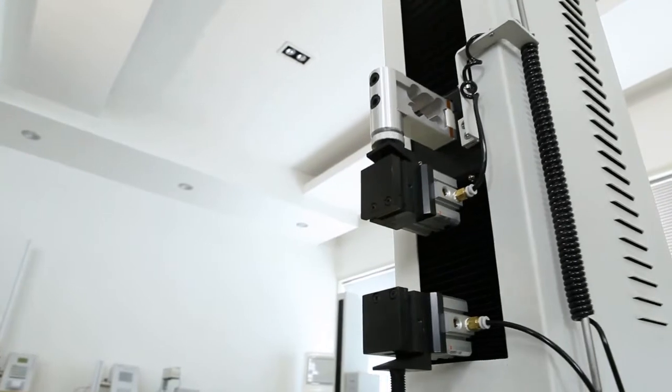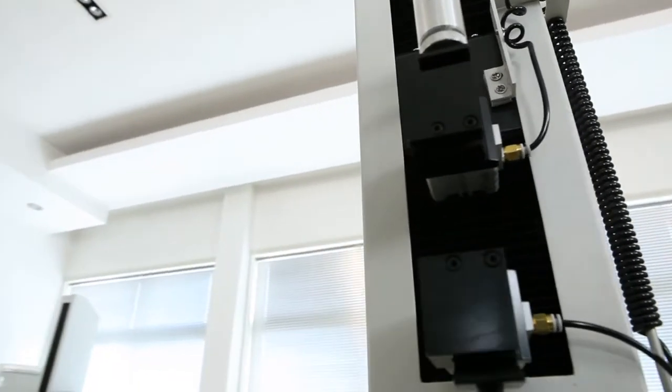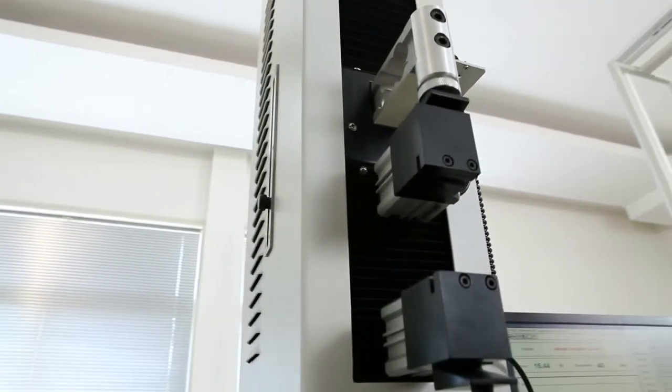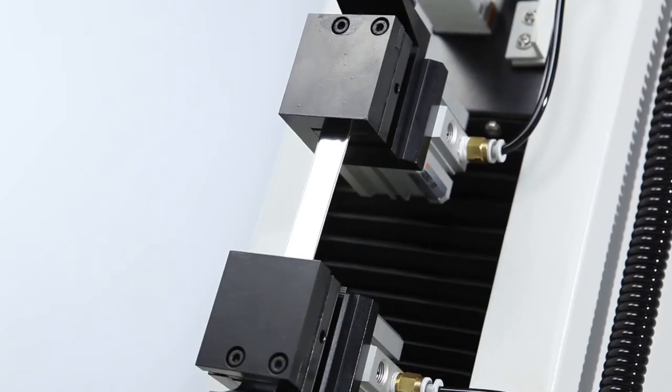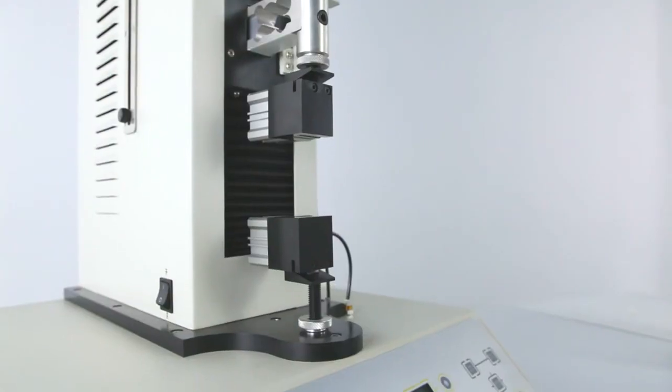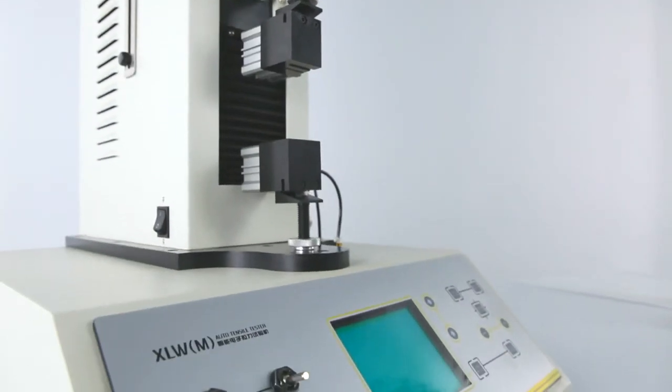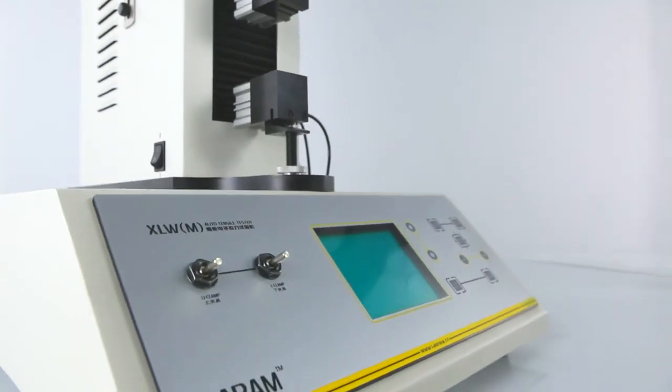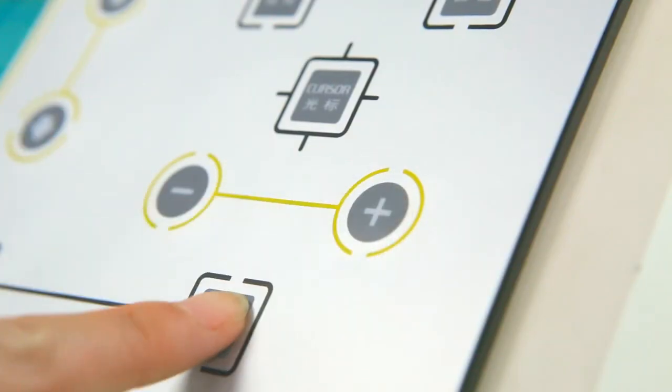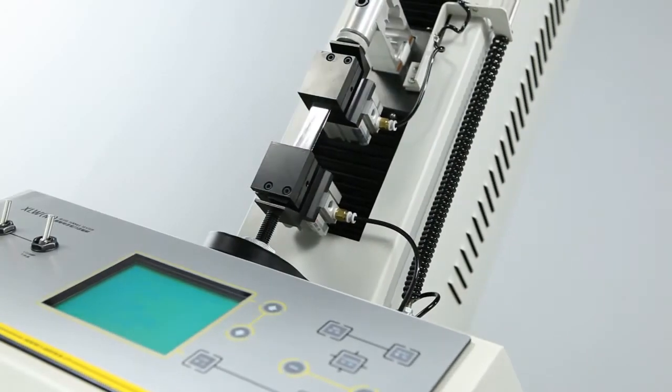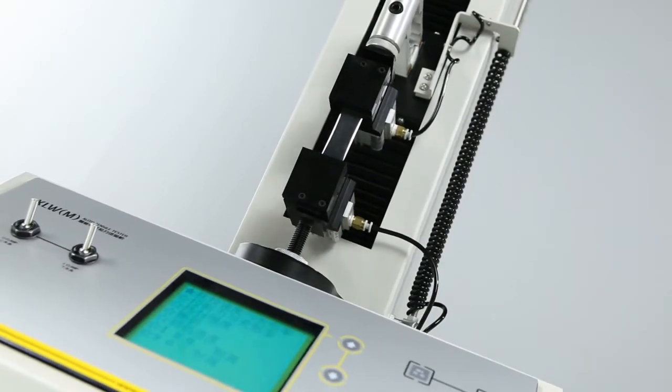The use of pneumatic clamps improves the automation of the instrument and test efficiency, while greatly reducing sample damage caused by manual clamping operation. The LCD display, PVC operation panel, and mini printer integrated with the tester allow users to operate tests without computers, improving operational flexibility and adaptability.